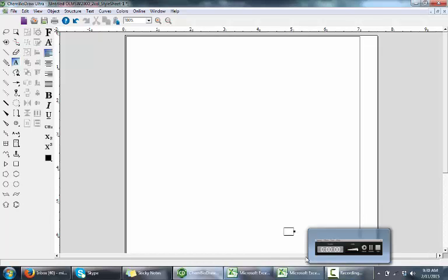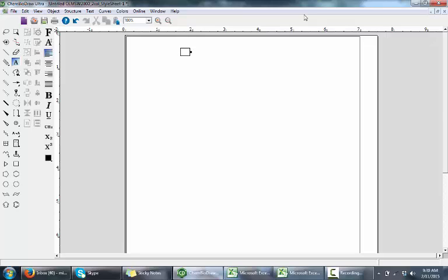So today we're going to talk about UV spectroscopy in particular. So let's write that down here. Hold on, UV spectroscopy. And this is the last in the tools of the spectroscopy that we talked about in terms of structure determination.